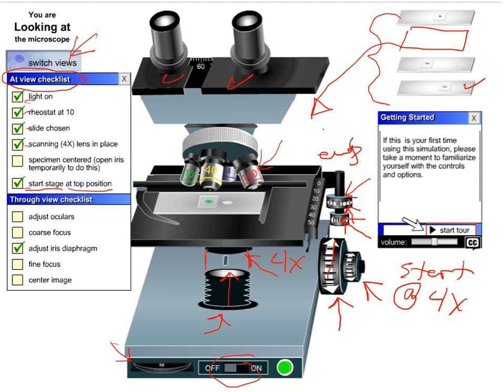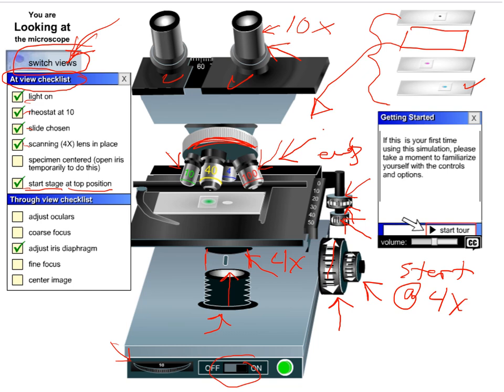A couple other things about microscopes: the ocular lens up here is usually 10x — that's pretty standard. Magnification occurs in the ocular lens and also in the objective lens down below. The objective lens can be adjusted from 4x to 10x, and the yellow one is 40x — you grab the wheel to move them. When you go to the switch-views button, it's going to take you into what it looks like when you're looking through the eyepieces, and you'll start to actually see something. Then you'll probably have to adjust with the fine focus or coarse focus.